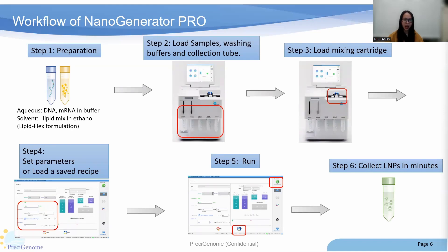First, we prepare our mRNA sample and lipid formulation separately in two centrifuge tubes. Then we load the samples, wash the bubbles, and place a clean collection tube into the reagent slots on the Pro. Next, we simply insert the mixing chip into the chip holder. After setting the parameters, we save the recipe and hit run. Your mRNA lipid nanoparticle product is ready in minutes.